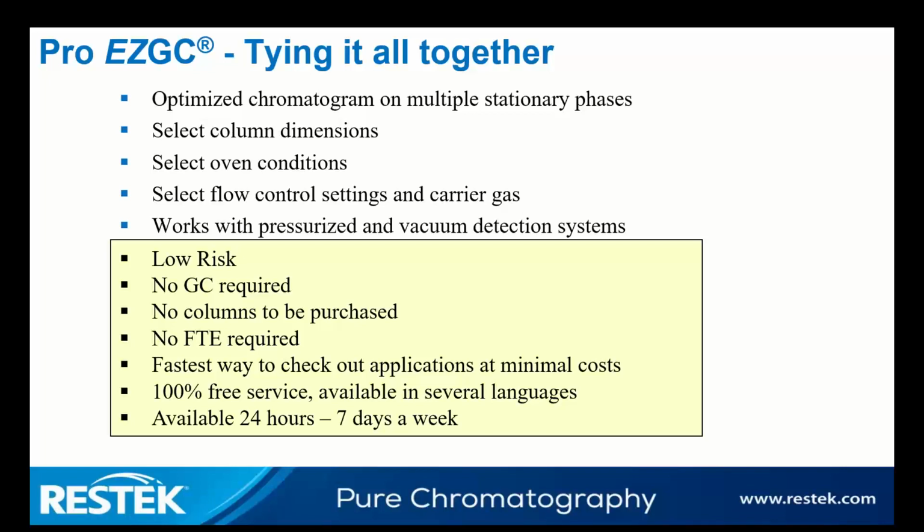You can look at those two as options, depending upon what you're doing. And then between whether you're doing an FID, which is pressurized FID, PID, any of those types of detectors versus a mass spectrometer. So nice part is, you can go in and take a look at it. There's really no risk, and you can save that.